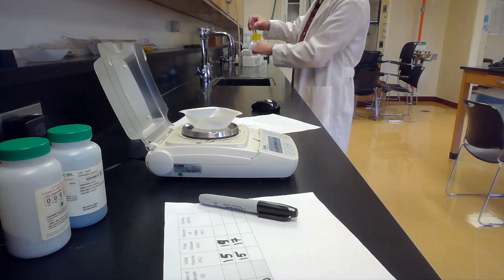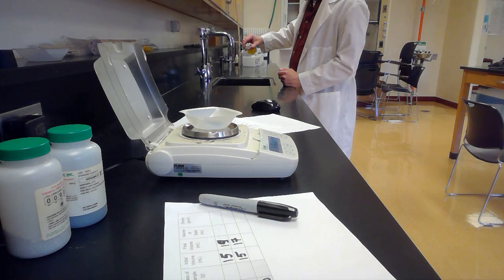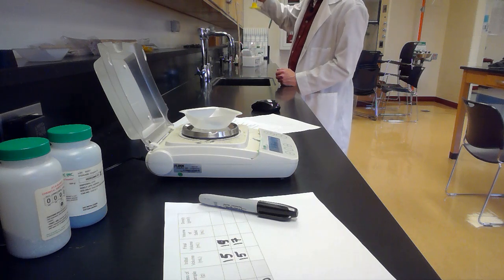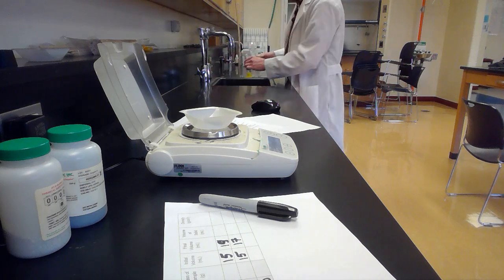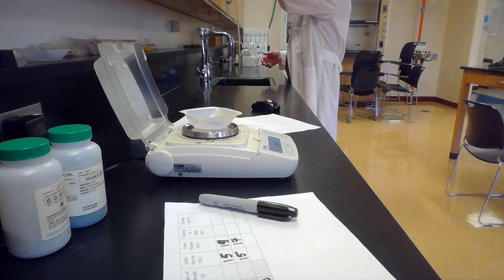Now I've been filling it to, you know, pretty much exactly 15 to start. Does it need to be that? No, it could be really anything. Just something to start. It just makes it a little bit easier for it to be pretty close to exactly something. Makes the math a little easier later.